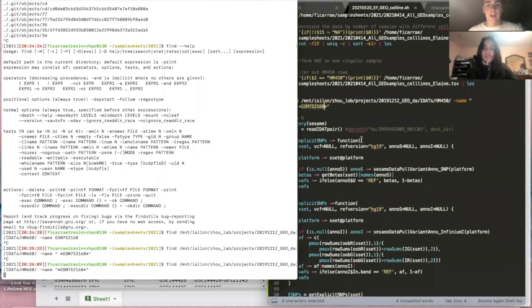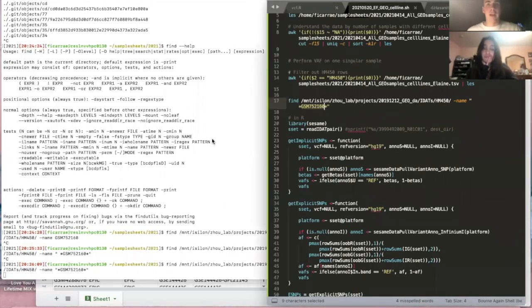Oh, man, I'm also running something on my end, because I'm just trying to list all of the files in that directory. I'm generally curious how they're formatted, because I have no idea what they look like.